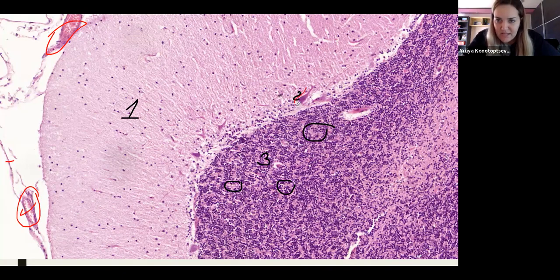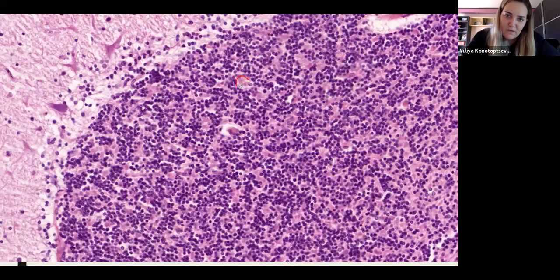These are the cell bodies of the Purkinje cells, right? These nuclei probably belong to the basket and stellate cells. And the lower layer is going to be the granule layer. Do you see that we have some kind of empty spaces here? These little tiny empty spaces in the granular layer, so we magnify to them. This is the cerebellar glomerulus.